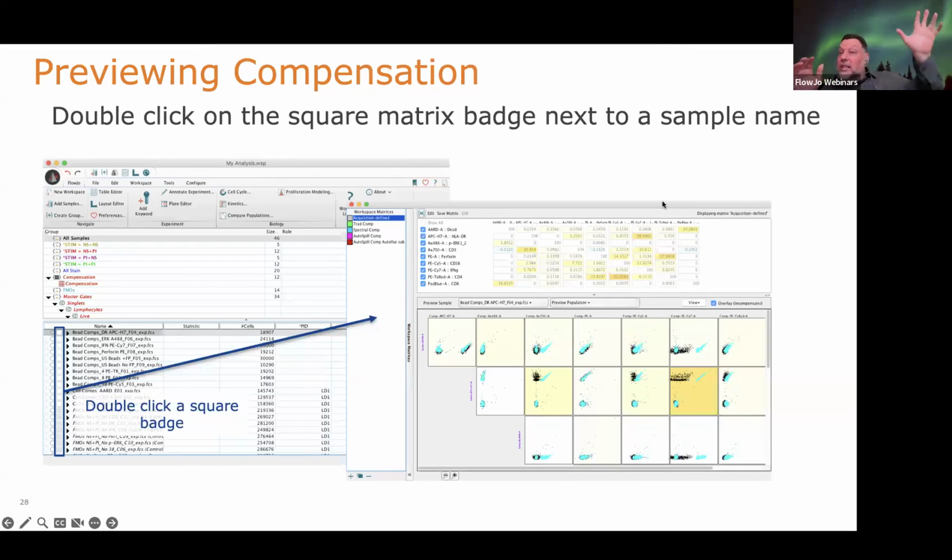I also want to look at these, but really I'm going to focus on this as my main core. And so that's what I'm going to compensate for and do autofluorescence subtraction for. I can still get the frequencies of other populations. Maybe they won't be ideally compensated, but is it good enough? And am I ever going to actually use that information on that other subpopulation is the other problem, right?